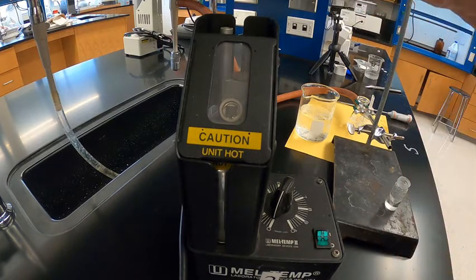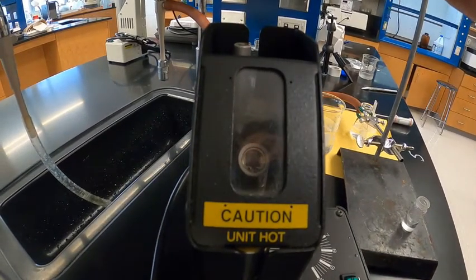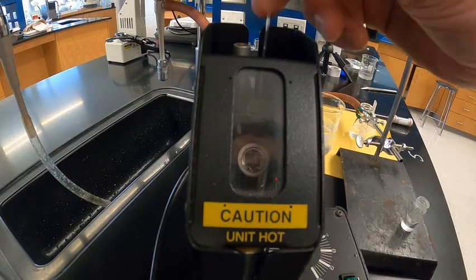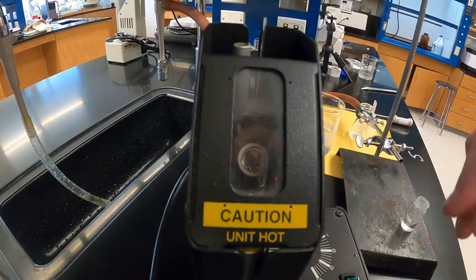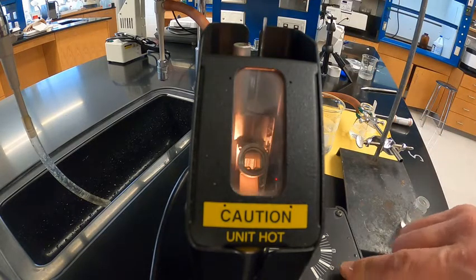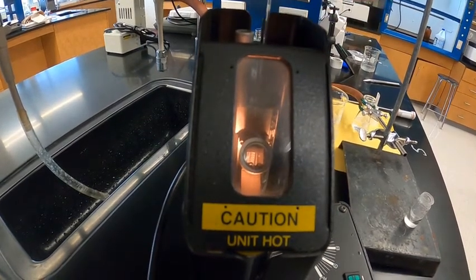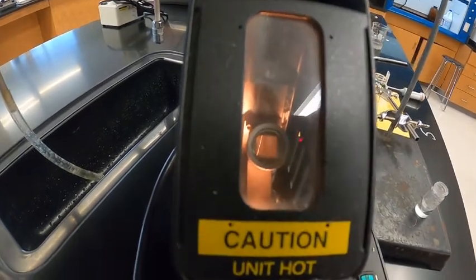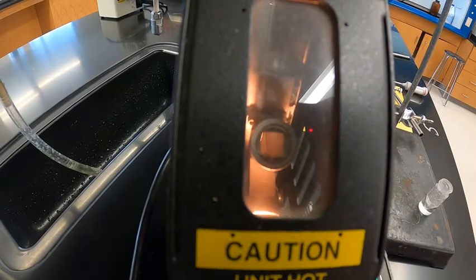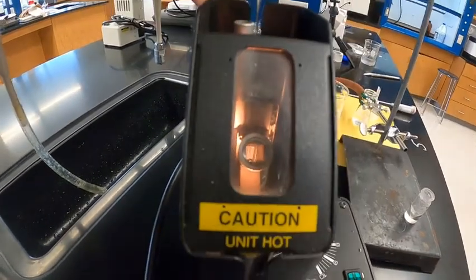and then inside the melting point apparatus there's a little window and a rectangular groove that window looks into. So I'm going to put the capillary in that little rectangular groove, and when I turn on the instrument, now it lights up. I'll move the capillary in and out so you can see where it's going, hopefully. And that little lens there is what we'll look in to watch for it to melt. And it's probably going to be pretty hard to catch this on the camera, but I'm going to talk you through it.